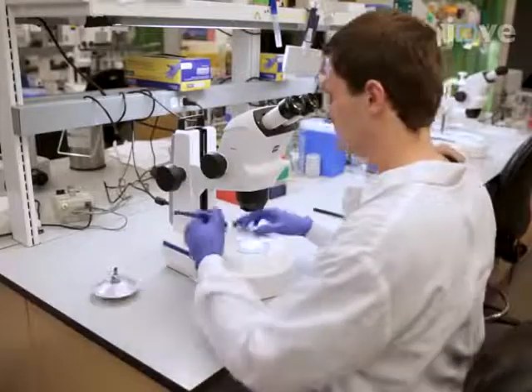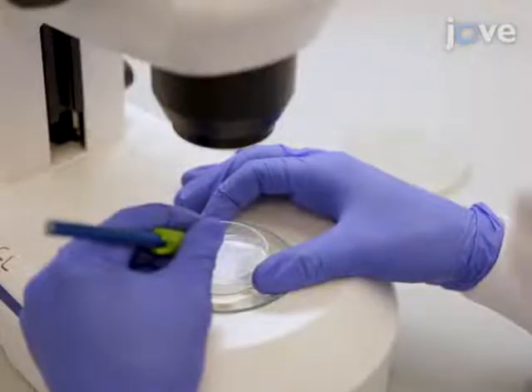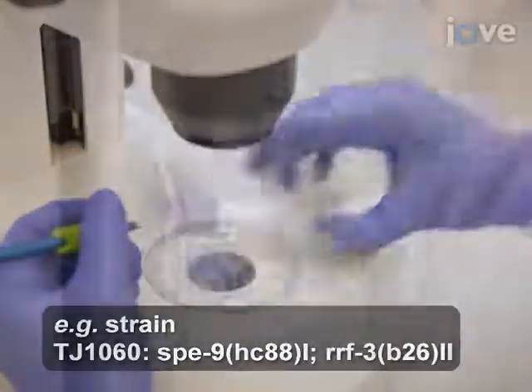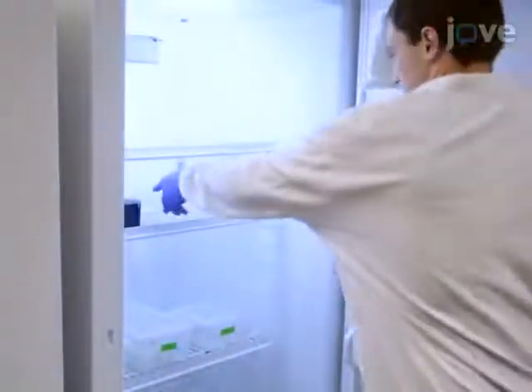To set up the C. elegans cultures, use a worm pick and a dissecting microscope to transfer 20 eggs onto each mass culture plate and incubate the plates at 20 degrees Celsius for 6 days.